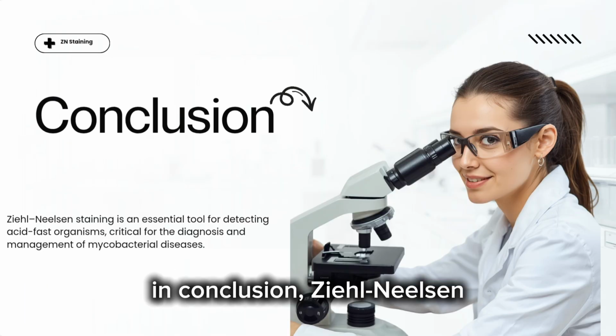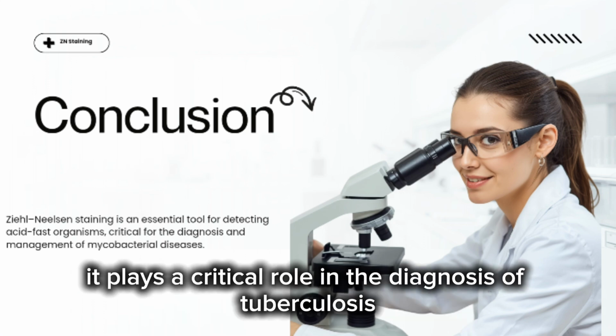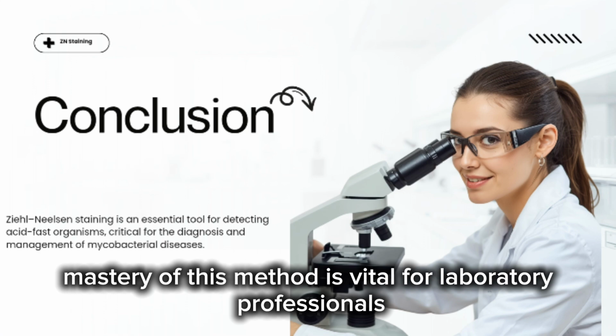In conclusion, Ziehl-Neelsen staining is an essential technique for detecting acid-fast organisms. It plays a critical role in the diagnosis of tuberculosis and other infections. Mastery of this method is vital for laboratory professionals.